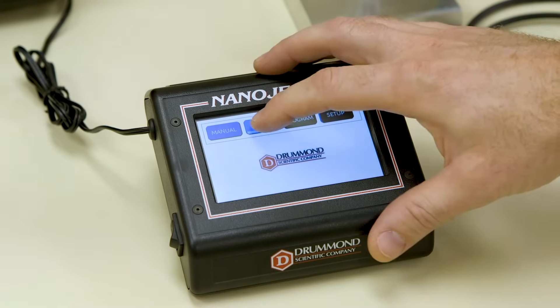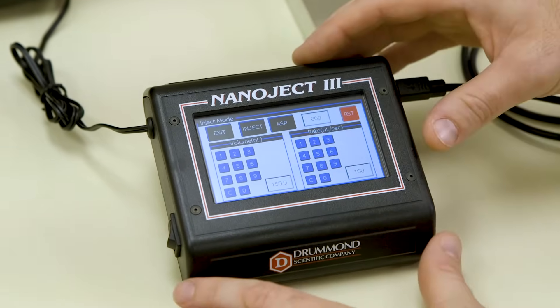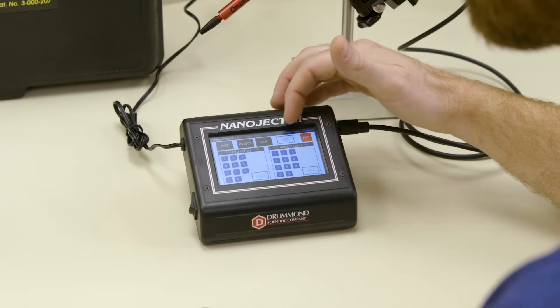Next is the Inject mode. Here you can set your volume and rates of injection. The ASP button is a newer feature which allows you to aspirate a specific volume into your micropipette. There's also an injection counter which can be reset at any time.